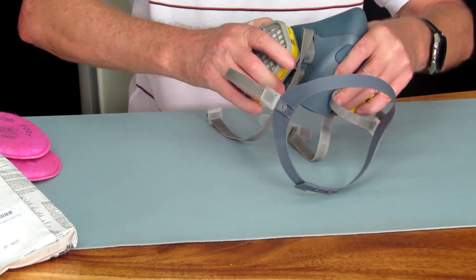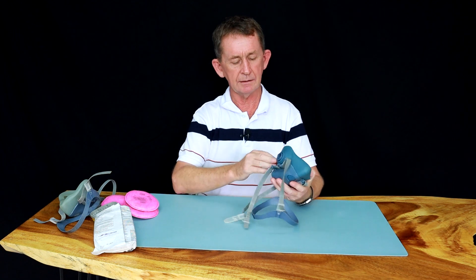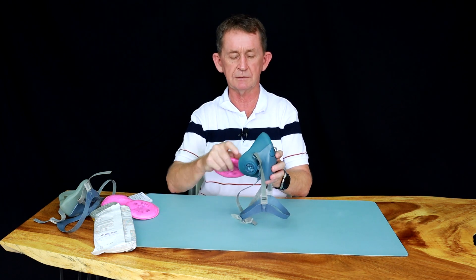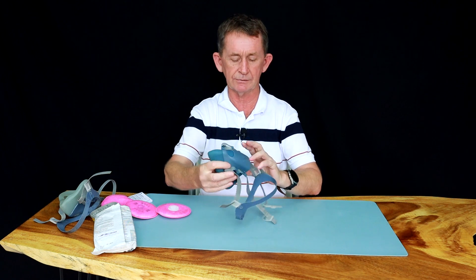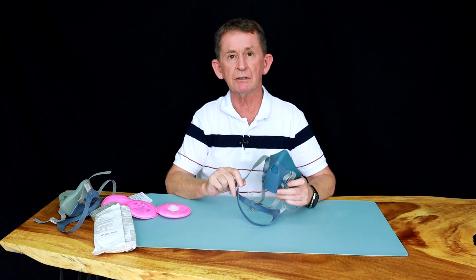I'll take the filters off now and show you how these work. There's a little valve here — when you breathe in, you suck through there and the valve opens out. When you breathe out, there is a flap valve right in here, silicone, and the air goes out the bottom. That's a great advantage because you won't create condensation on a face shield or anything like that.